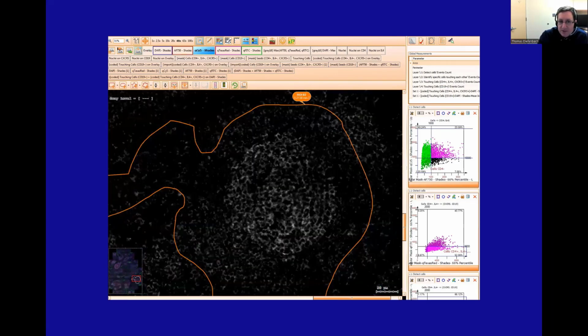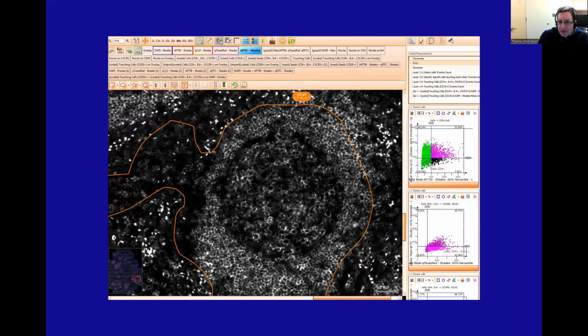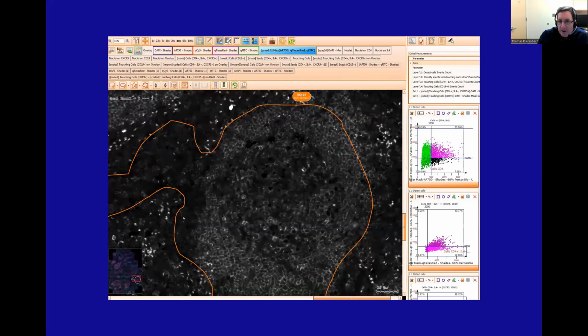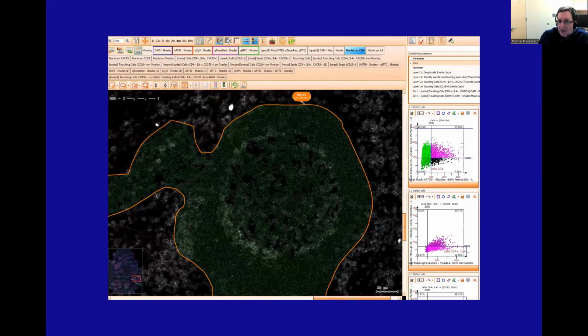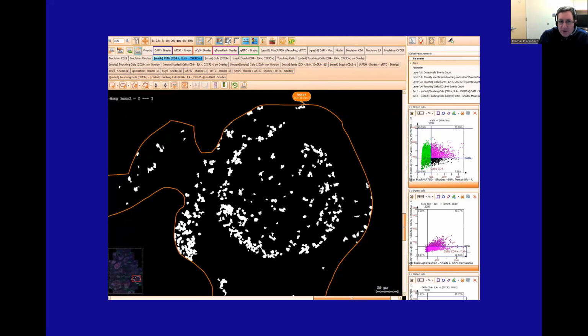This is the Cy5 channel, Texas Red channel, the FITC channel. This is the AF750, Texas Red, and FITC. So we're looking at a combination of markers. Here's the segmented nuclei and CD4. Here is probably easier to see. Now we're looking at just the cell masks of triple positive CD4, IL-4, CXCR5 cells.